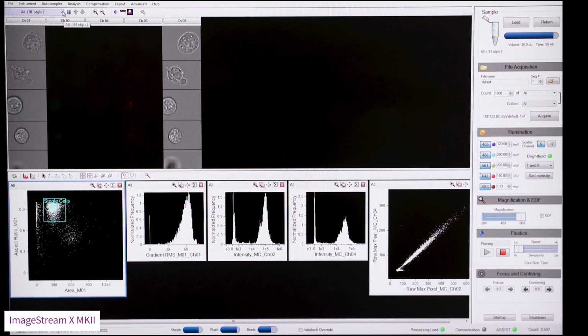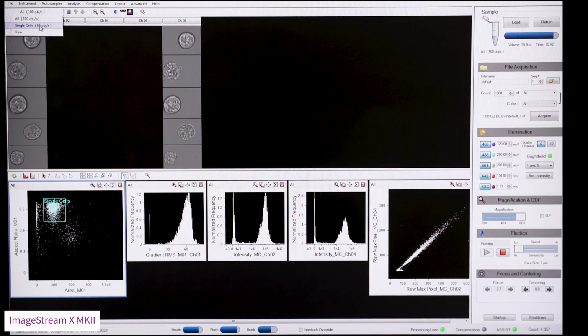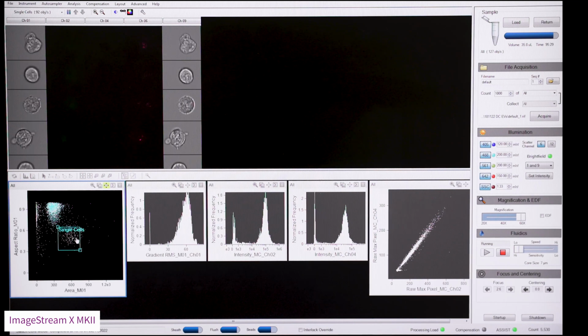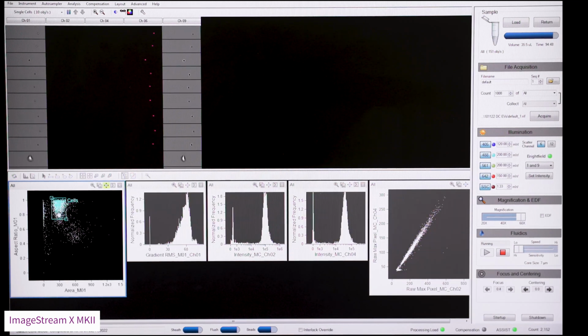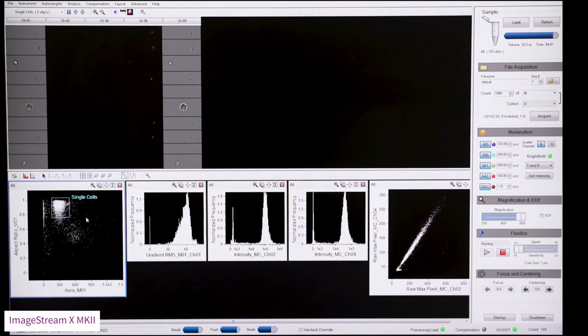We can view the events in our single cell region by selecting it on the population drop-down box. If you want to check what you are gating is correct, move the region and view the cells that are gated. Here you can see the cell aggregates and coincident events. We can also see the debris and small speed beads which run through the machine at all times. Once you are happy with this selection, we can move on to the focus of the cells.